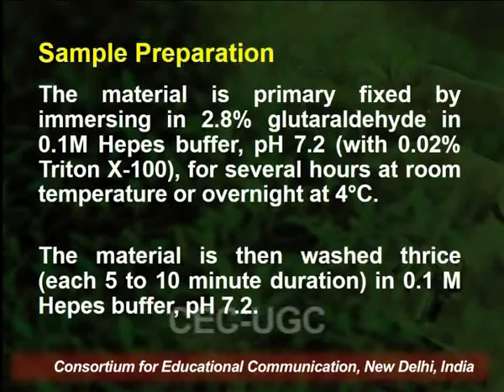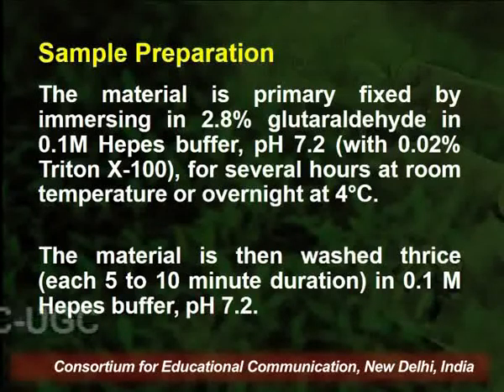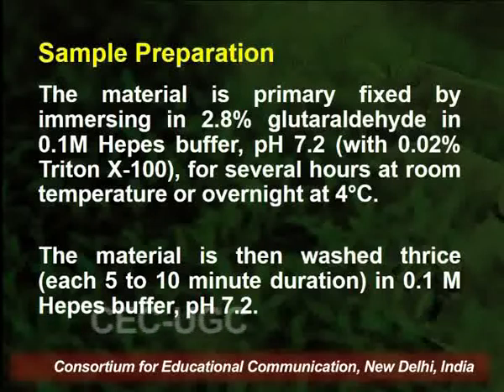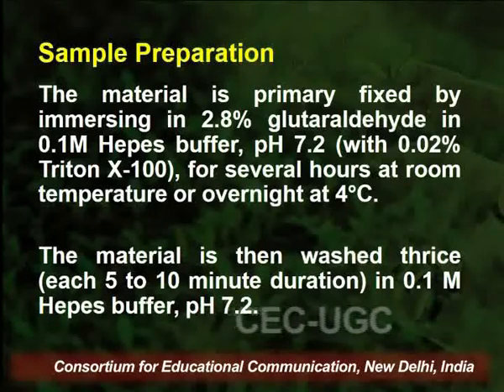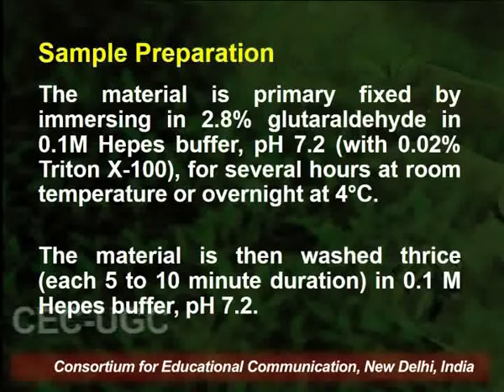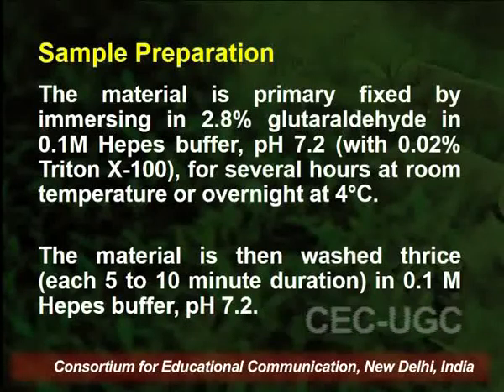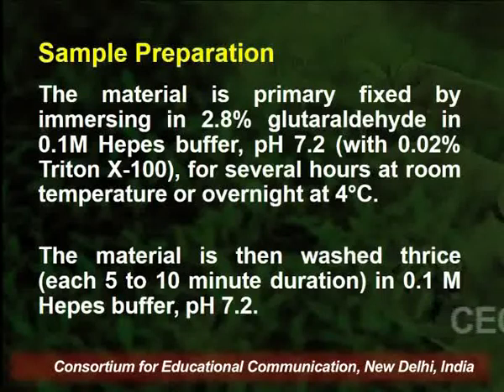So first, the material is primarily fixed by immersing in 2.8 or 3% of glutaraldehyde in 0.1 molar HEPES buffer at pH 7.2 with 0.02% Triton X-100. This process is done for several hours at room temperature or overnight at 4 degrees Celsius.